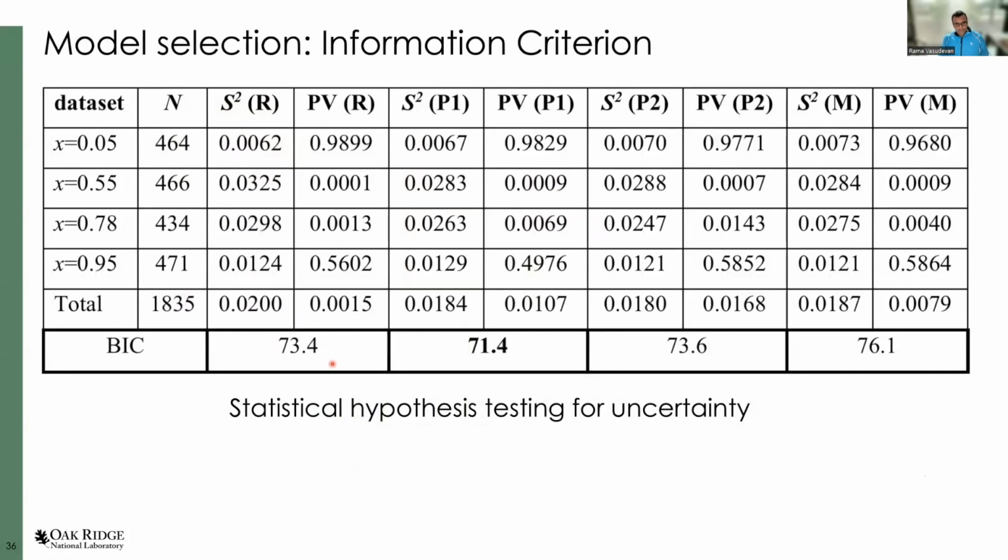But again, it's also why I think it's very important to have theory in line with experiments, because if we were collecting the data while we were coming up with these different kinds of models, then we could have directed the microscope to capture more data so that we could be more confident in our hypothesis testing itself, right? And so this gets at some of the bottlenecks that we have if we don't have automated and autonomous experiments that are coupled with theory for understanding interactions in many of the material systems that we are able to study with scanning transmission electron microscopy.